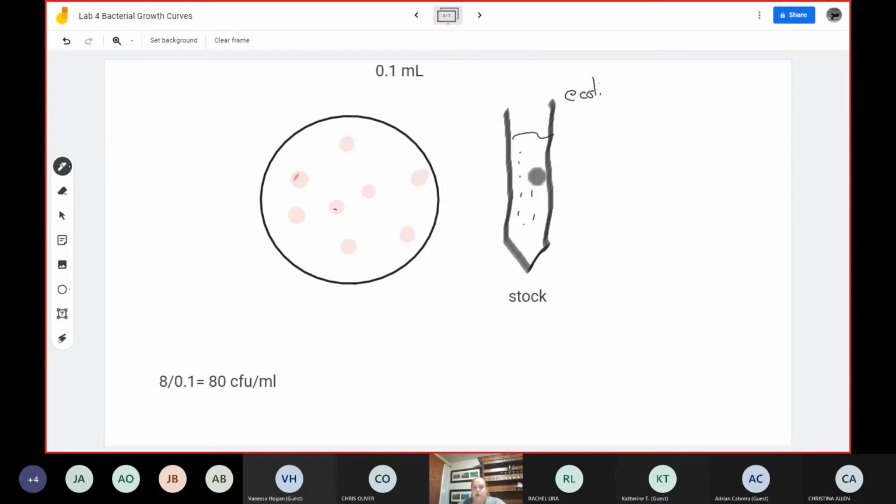All these happy little E. coli, you've grown it for 24 hours, so it's a cloudy solution, and you want to know how much of that bacteria is alive on your plate. So essentially you would take a pipette and pipette some amount out of here onto your plate. It's usually about 0.1 milliliters, usually a fairly small amount. And then you would spread this on your plate with your glass spreader after you sterilized it.